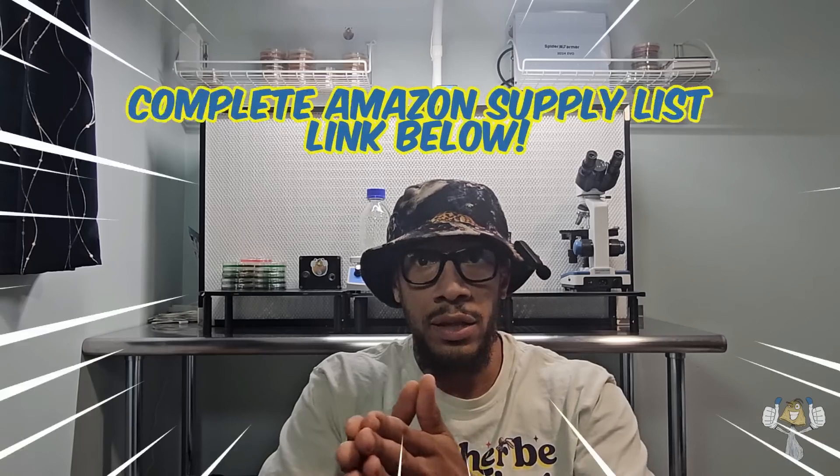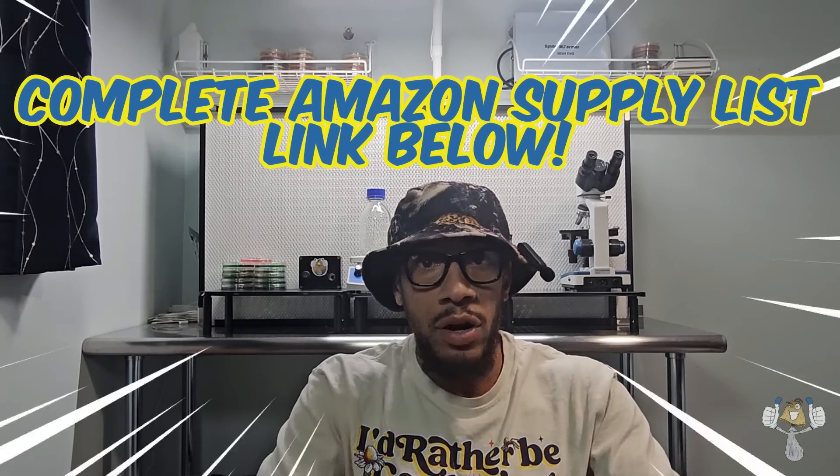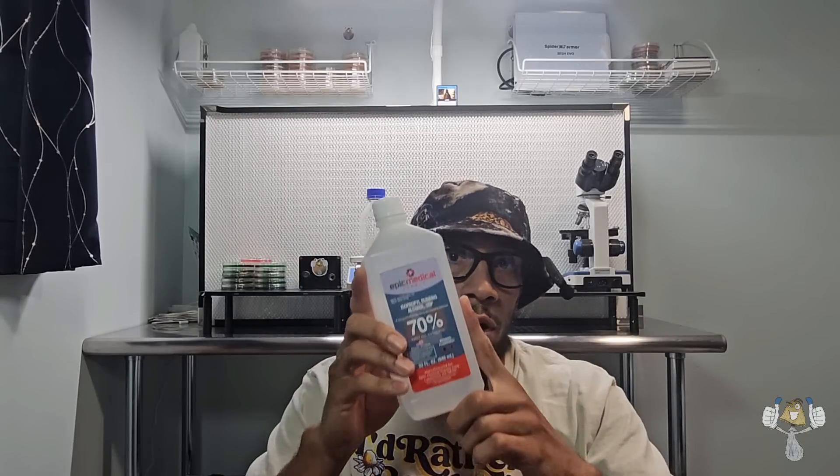You don't need exactly the name brands I'm using, but you're going to need what I put on this list. It's very important to have a very clean and sanitary environment, especially in the beginning. I started off in the corner of the kitchen and we had plenty of successful grows from there. So these are the essential beginning tools for that journey — let's get into it.